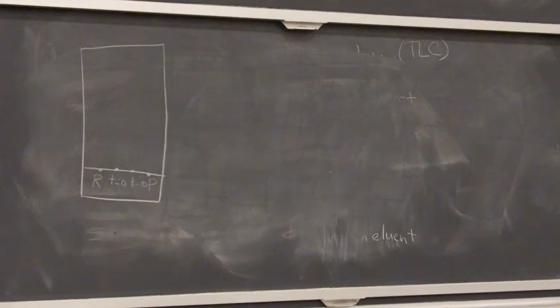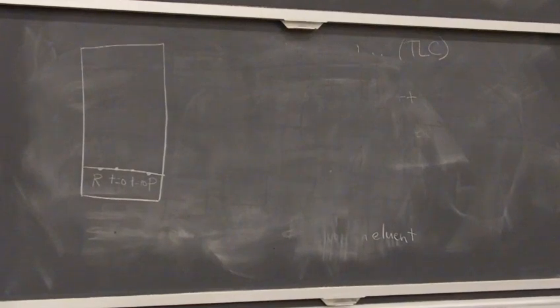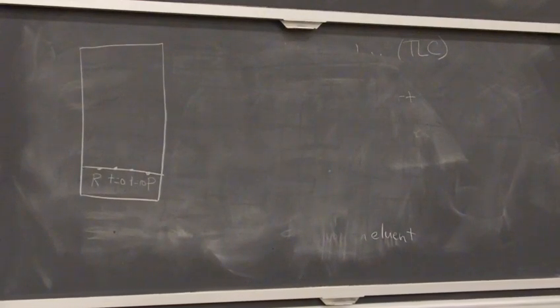For this lab, you have a report sheet that you'll be filling in. Okay. So the first part, you have all your information about your product. Everyone should be making the same product, so it's not like the unknowns where everyone's different. Everyone should draw the same structure here. You've got your name, give the melting point range of your product, your yield, your percent yield, date, and so forth. And then, what does that product look like?